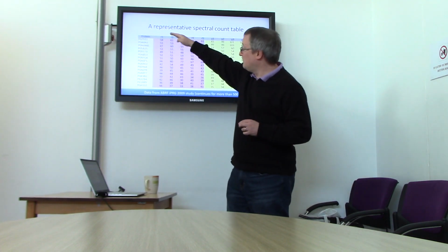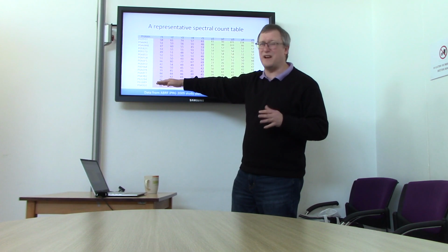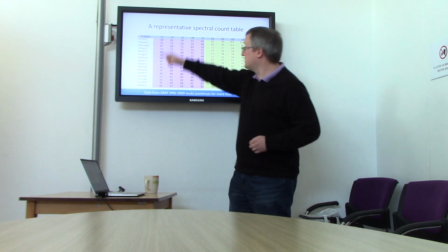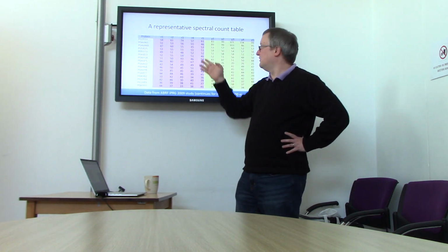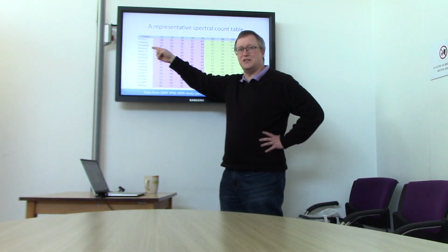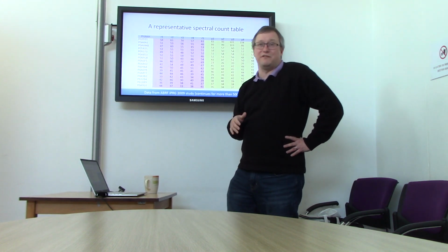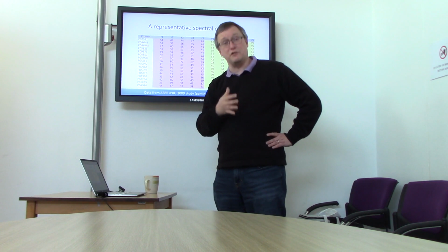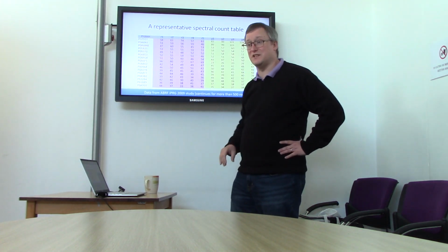Now, I note that PowerPoint is only letting me show this many rows, but there are actually something like 500 or 600 different proteins that we detected well here. So we've got 500 or 600 rows of this stuff. How do we go about creating a metric that tells us which protein differs between these 2 cohorts? I would think the first answer that comes to most people's mind would be something like a t-test. But in fact, there are some reasons why you don't want to use a t-test on this. We'll come back to this in the last segment of today, okay?